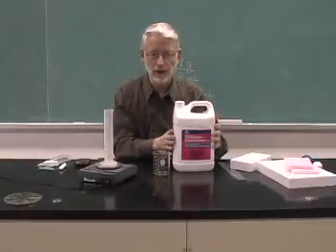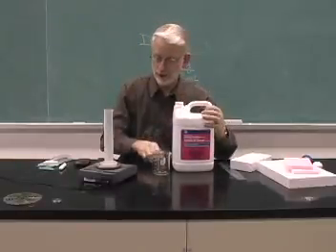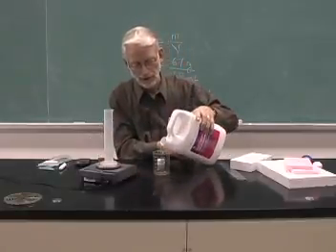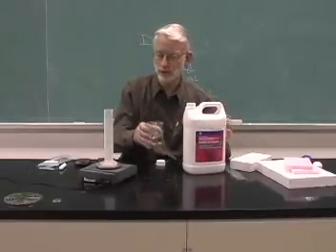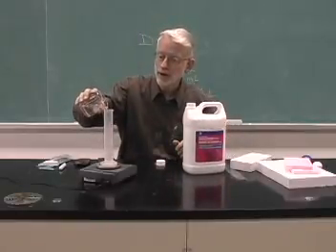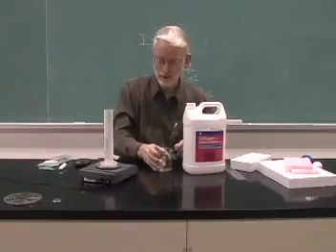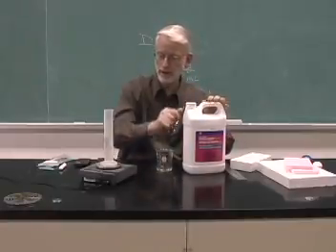I have some methyl hydrate or methanol here, and again we'll tare the graduated cylinder. I'll pour a little bit of methanol into a beaker to make it easier to pour, and again we'll add it to the graduated cylinder and determine its mass.